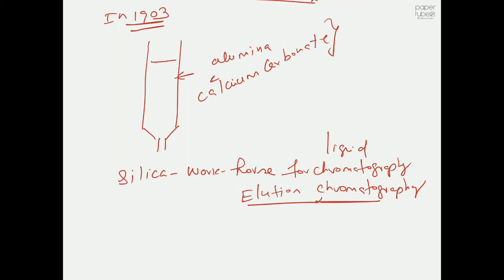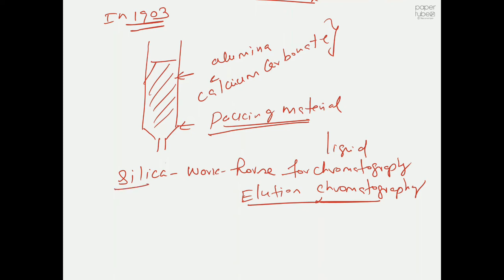I hope you all can follow up to this point. Sometimes we call this material, in purely chemical engineering terms, the packing material. I know you might have read what a packed bed is and how it works, when you studied something related to absorption and also adsorption. So silica is the packing material whenever we think about liquid chromatography.